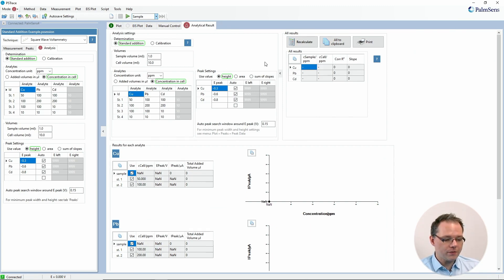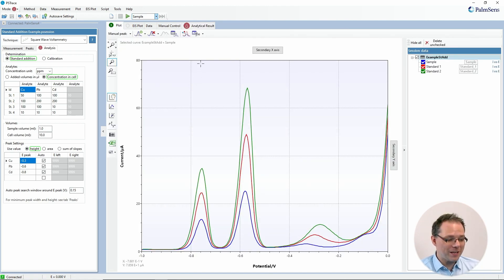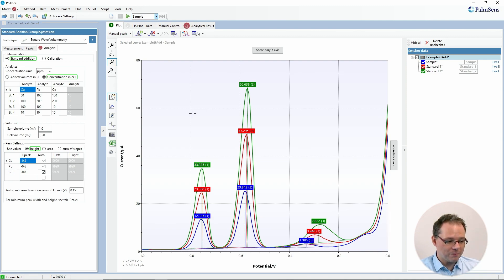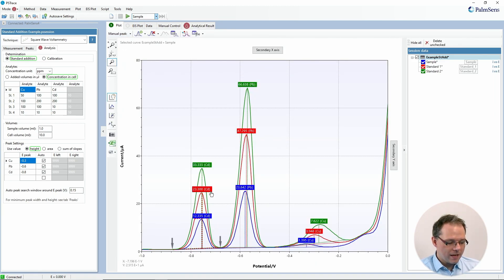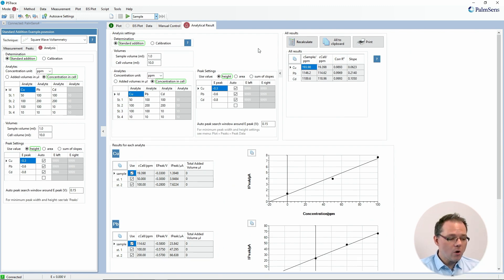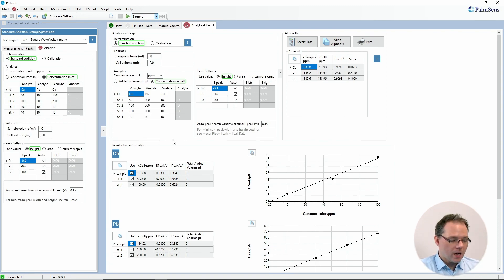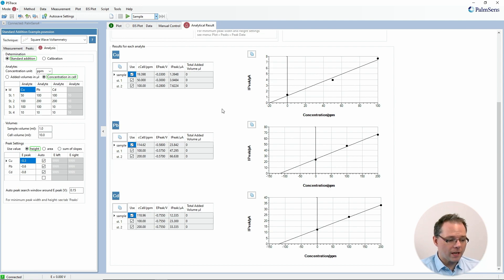In the analytical results tab you get a lot of summary information for all your different analytes. First we need to find the peaks we want to analyze — I just auto-detect the peaks and the different peaks are found. If I refresh the curves by recalculating, I will also see in the regular plot that the different peaks have been assigned to the different analytes I named in the table. Here we see an overview of the results, including the table we filled in, the settings for finding our signal, and any changes made after the measurement can be applied here and then recalculated.